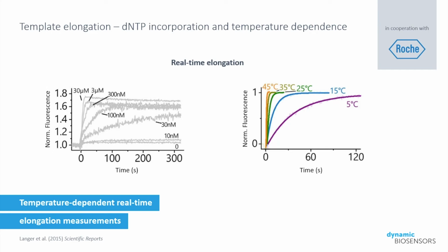So if you are working with polymerases that are temperature sensitive, we can modify the temperature on the switchSENSE surface, and we can monitor the changes in the activity rate by following the fluorescence changes from 0 to higher values. And then by changing the experimental parameters, we can actually modulate the activity of the polymerase. This ability is valuable when you are working with very fast polymerases, typically for the purpose of slowing down the readout and increasing the measured data points before it completes the full template elongation.